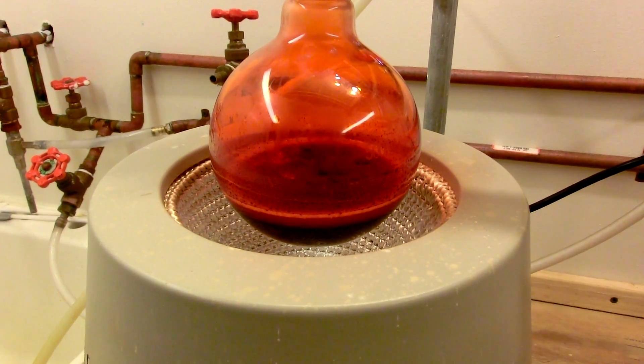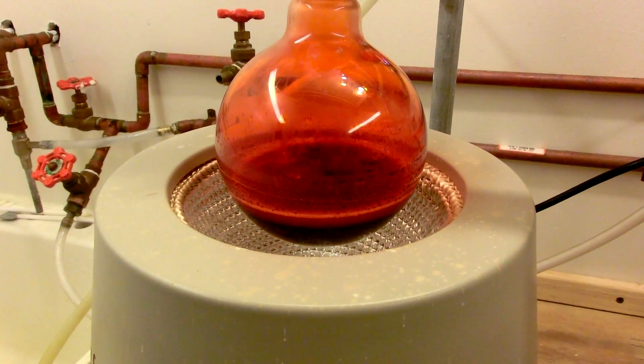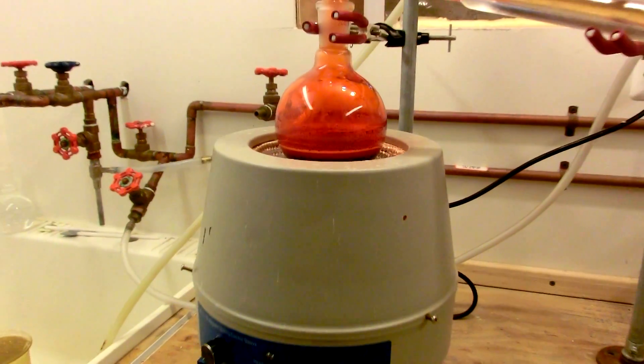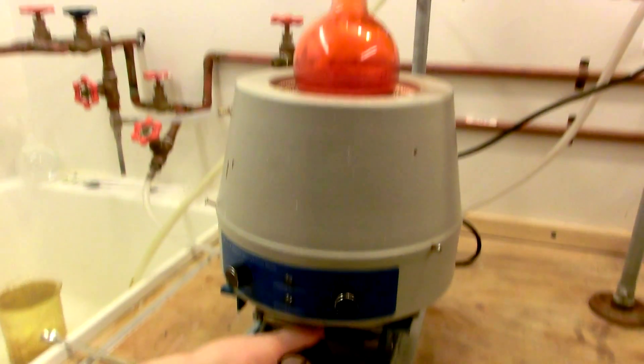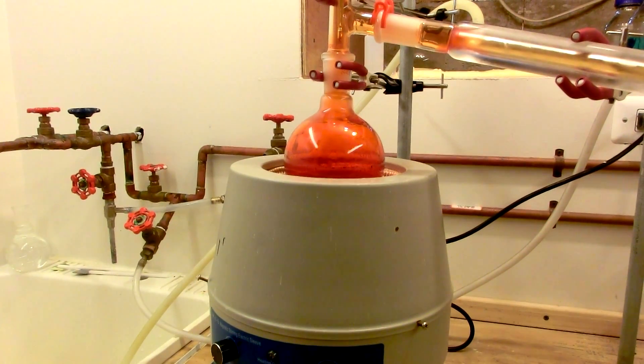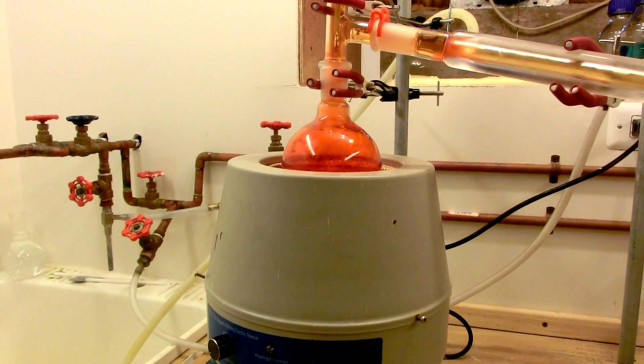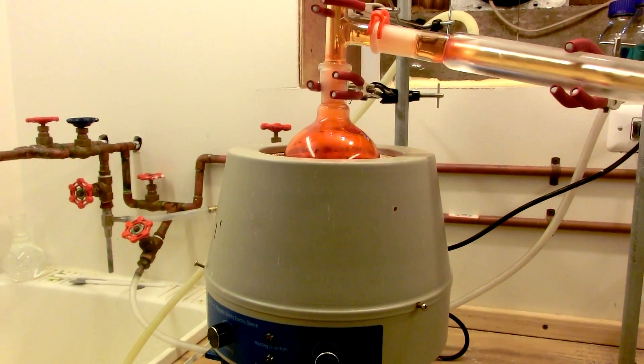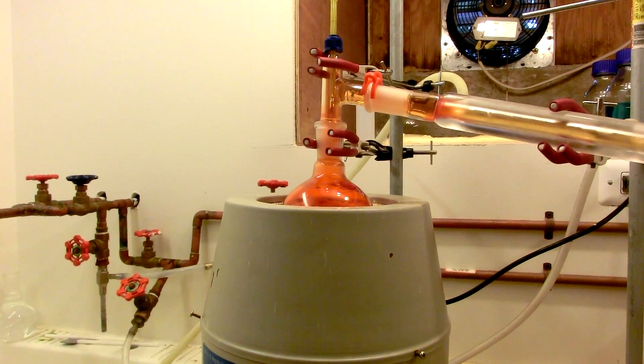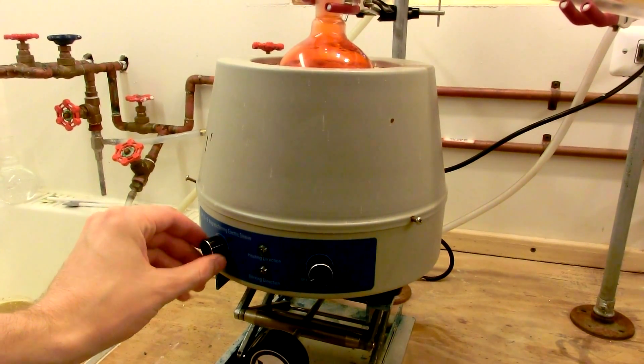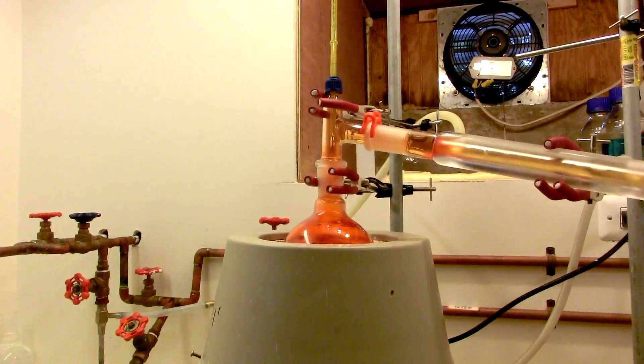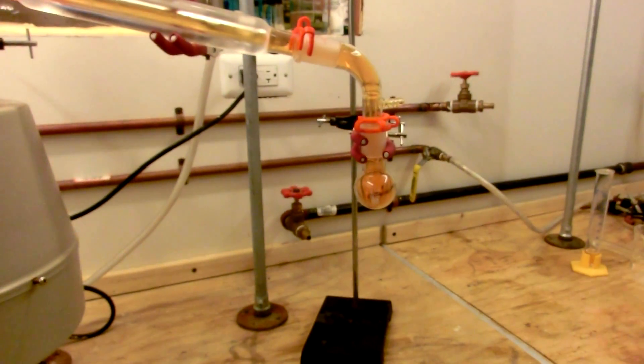The reactants have now been sitting in the vessel for approximately 10 minutes, so it's about time to distill. We'll simply raise the heating mantle. There we go. And turn on the heat. And in a few minutes, we'll begin to distill chromal chloride into this flask over here.